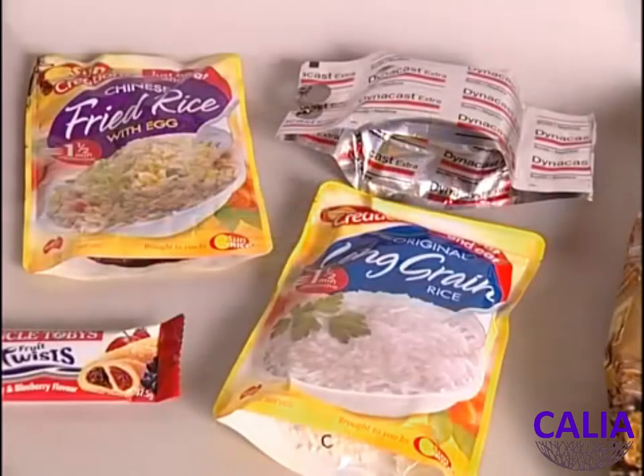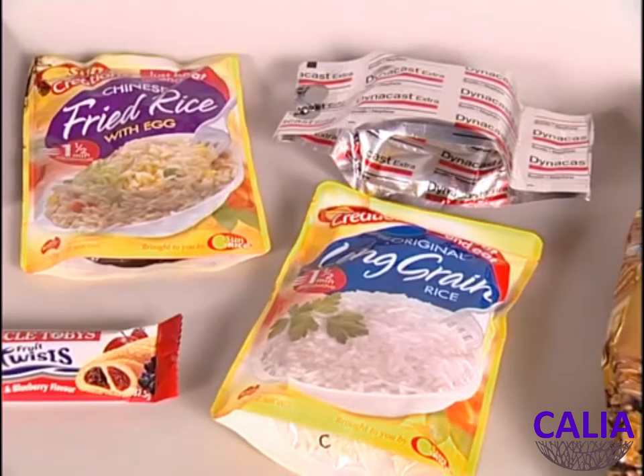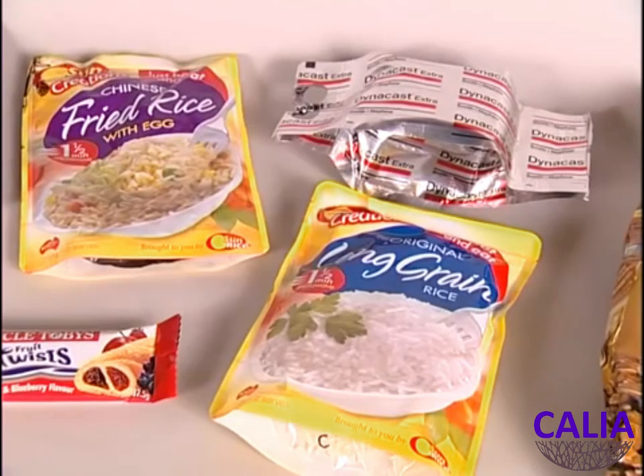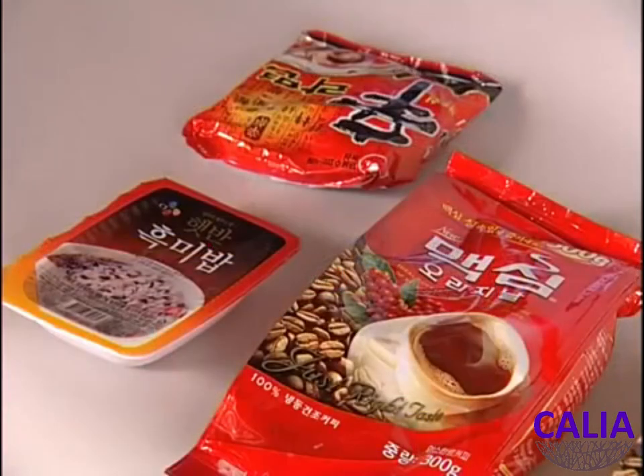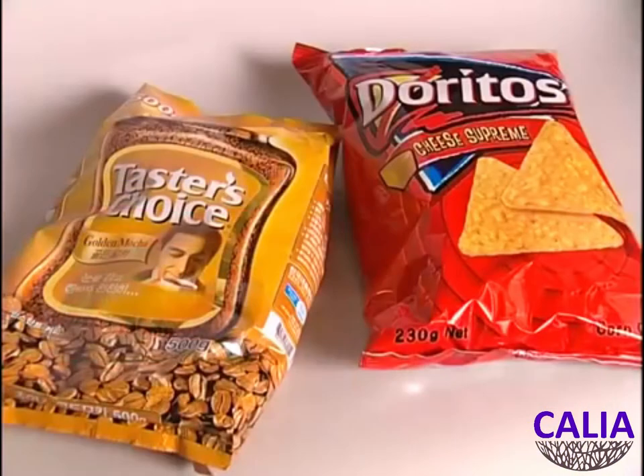Recent developments in food packaging use a modified atmosphere, or MAP, to extend the shelf life, and have heightened the need to check that the atmosphere cannot escape due to poor seals. The practice of immersing a package in water is often undesirable due to operator subjectivity, cleanliness and damage to the pack.